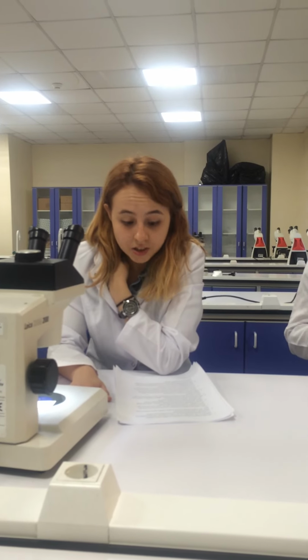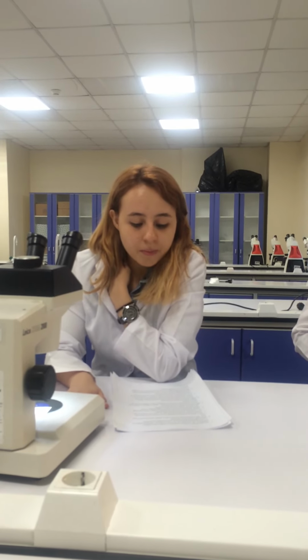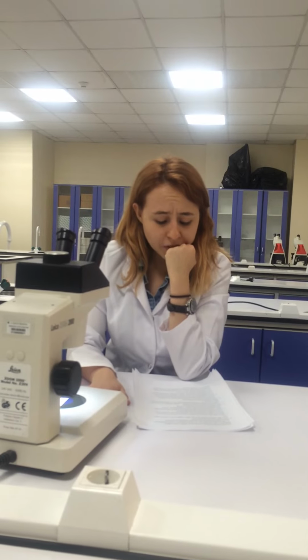Medium is replaced with osteocyte induction medium every 3 days. Mature osteocytes will form by 14 days of differentiation. These osteocytes are ready for alizarin red staining. Differentiation of porcine adipose-derived stem cells into chondrocytes is the other step.